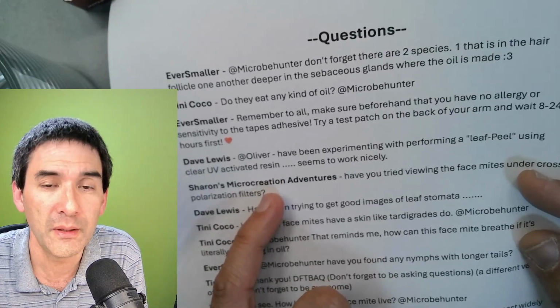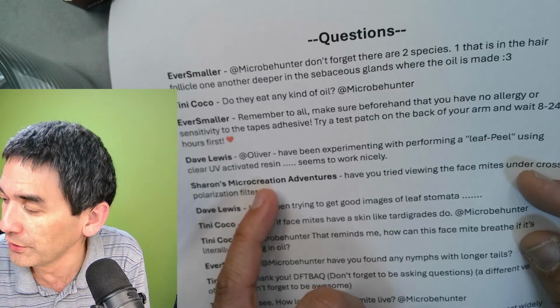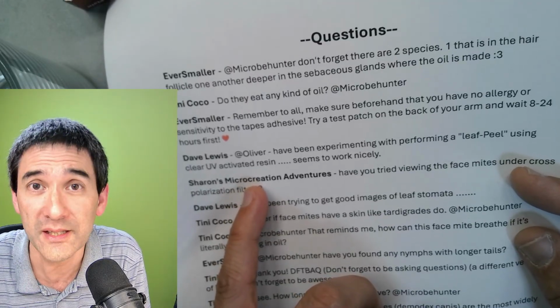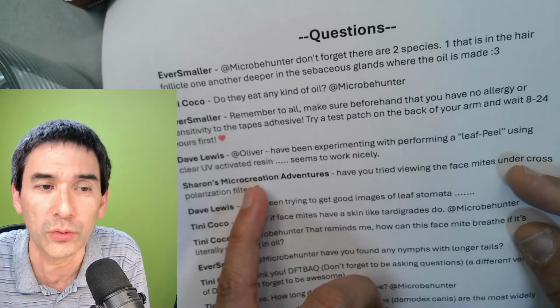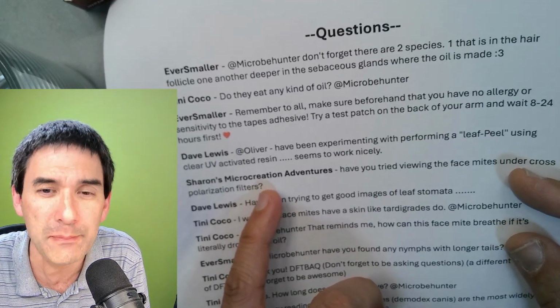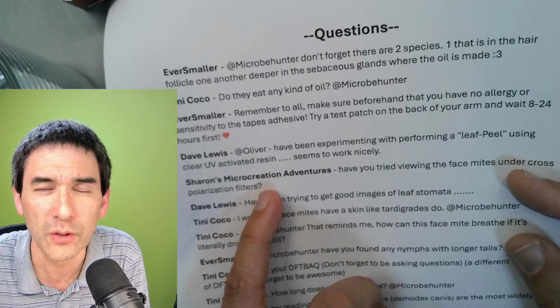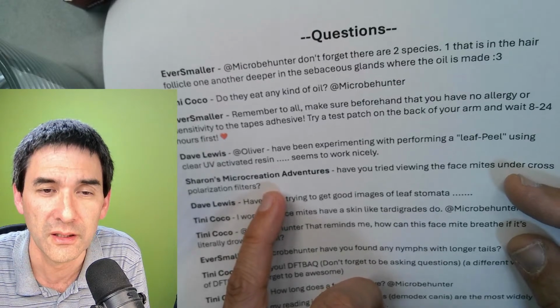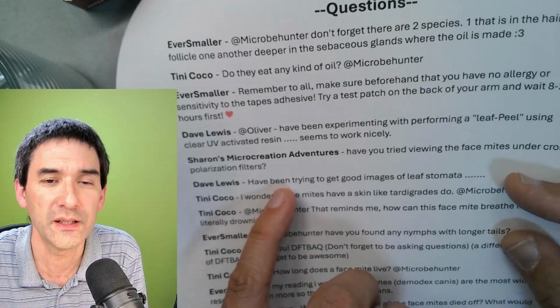Have I tried looking at them under cross-polarized light? No. And I have to be honest, my microscope does not allow for standard cross-polarized light. I do have a DIC microscope, that's correct, but there are prisms in there as well, so I don't have standard cross-polarization. I would guess that maybe you won't see a lot, because I don't know if the face mites are depolarizing the light to the extent that you're able to see anything. But one would have to try it out. Okay, good. The stomates, we talked about those.